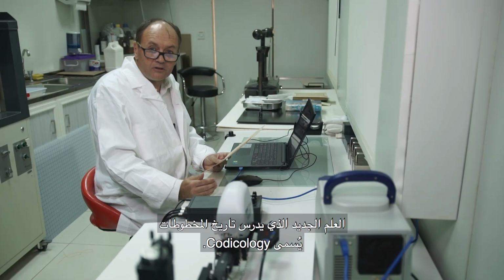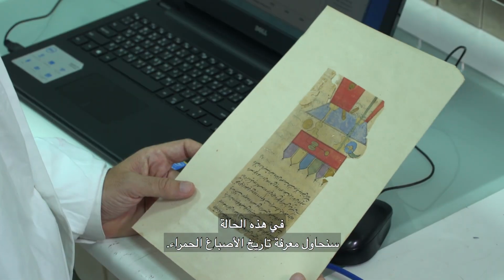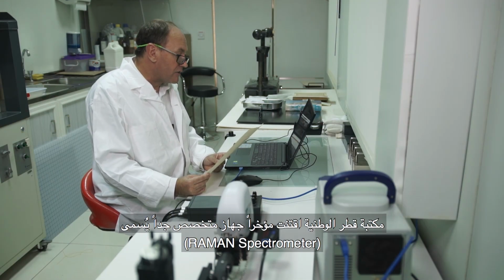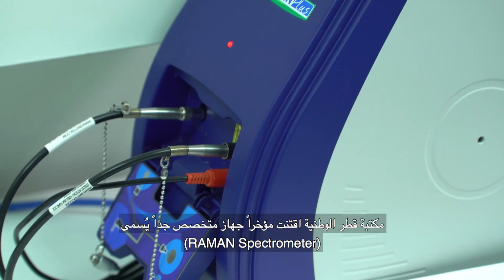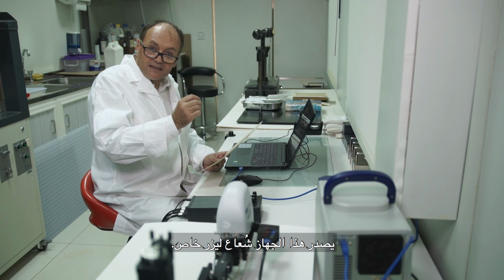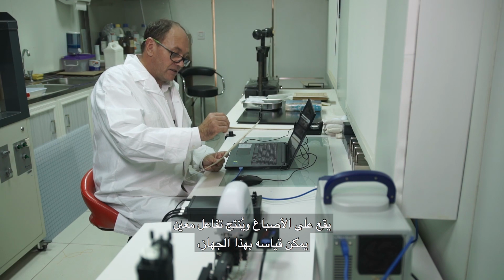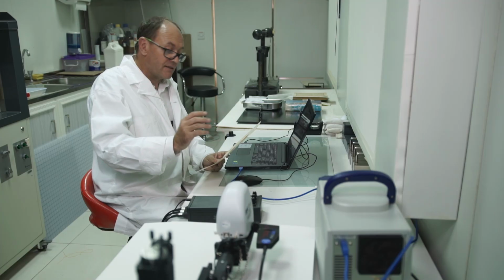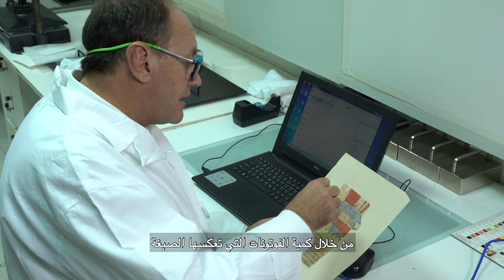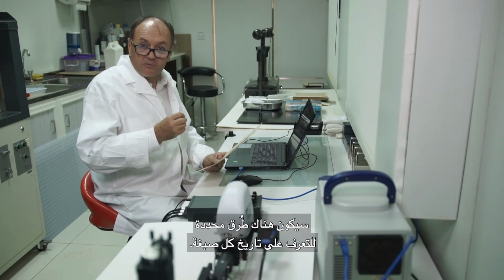It's a new science for the history of manuscripts, which is called codicology, the history of the codex itself. In this case, we are trying to identify the red pigments. For that, the Qatar National Library just acquired a very specific device called a Raman spectrometer. A Raman spectrometer works with a specific beam of laser light which touches these pigments, and a specific reaction can be measured by the device. From the quantity of these photons and where they are reflected, there will be a specific identification for each pigment.